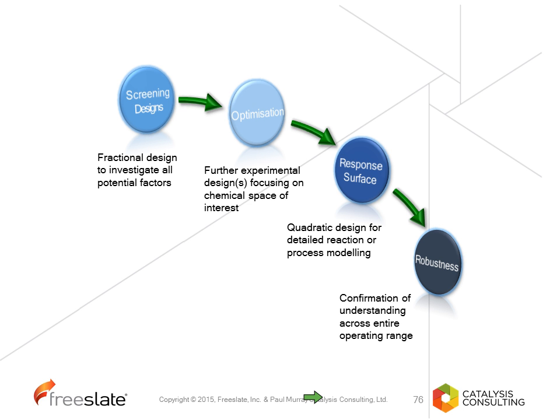And the robustness design is designed to look at when you've identified which factors and which ranges, and you're planning to run something on a large scale, and you want to be really sure that all of the ranges that you're going to set, the variation you allow in the process, will give you the desired outcome.